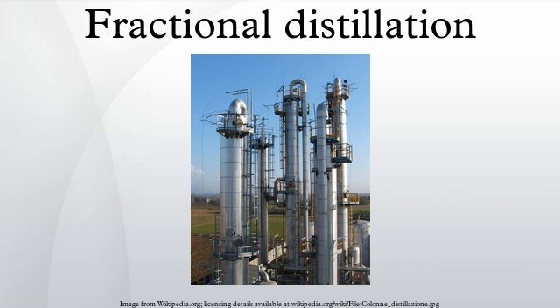Apparatus. Heat source, such as a hot plate with a bath, and ideally with a magnetic stirrer. Distilling flask, typically a round-bottom flask, receiving flask, often also a round-bottom flask, fractionating column, distillation head, thermometer and adapter if needed, condenser, such as a Liebig condenser, Graham condenser or Allen condenser, vacuum adapter, boiling chips, also known as anti-bumping granules, standard laboratory glassware with ground glass joints, for example quick-fit apparatus.